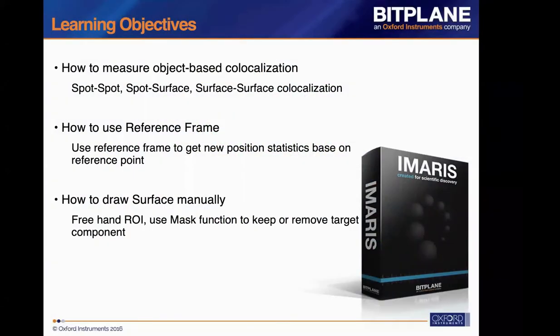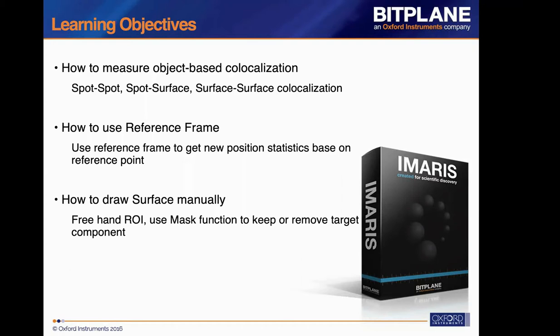Today's learning objectives. First, I will introduce how to measure object-based co-localization, basically between spots and surfaces. I will introduce how to use the reference frame to get a new position statistic based on reference points, not the origin of the axis. Lastly, I will introduce how to draw surface manually. This is quite useful in many different applications, especially if you want to create a freehand area in the 3D space, or if we can use the mask functions to keep or remove some components we want or don't want.